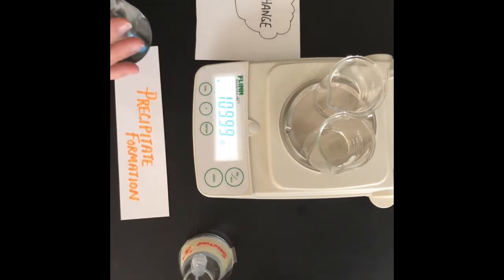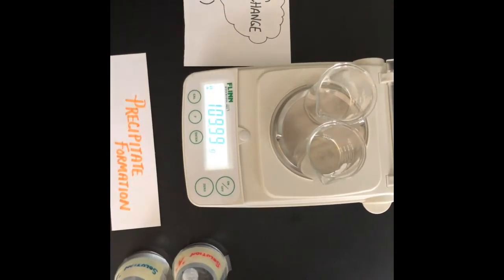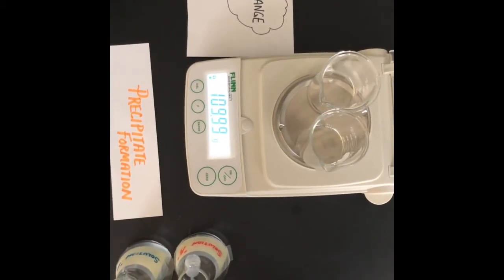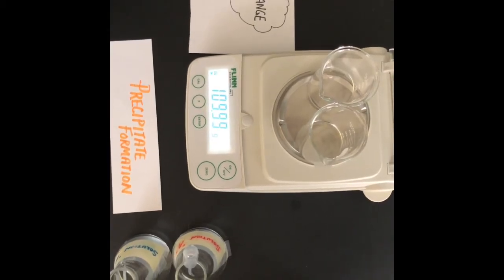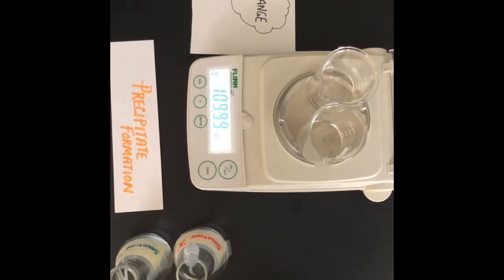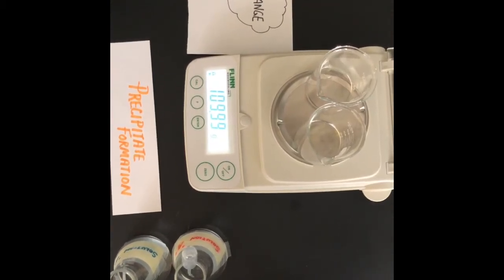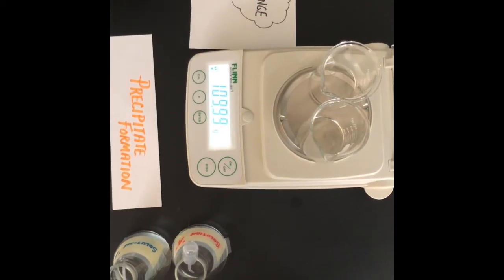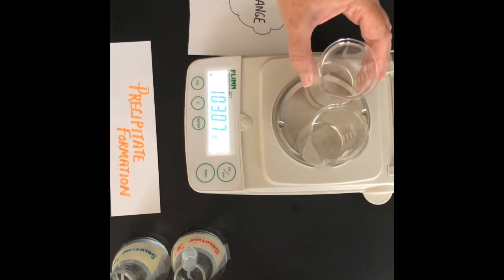You will now notice that the balance changed because we added mass, the 2 solutions. So now the mass of the beakers together with the solutions is 109.99 grams. In order to create the precipitate, I'm going to pour 1 beaker into the other, but leave both beakers on the balance. We will see what happens to the mass.